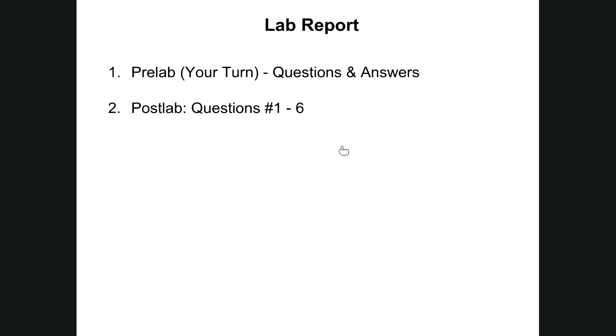So it's the usual bit for your pre-lab questions and answers, and then you're going to answer all 6 questions in the post-lab, and I need to go over something in the post-lab. So I'm going to pull up the PDF file that I have here, because there's something I want to point out. It's in your lab procedures, and you have to know what some abbreviations stand for, or else it's going to be difficult to analyze your gels even for next week. So let me see. Here we go.